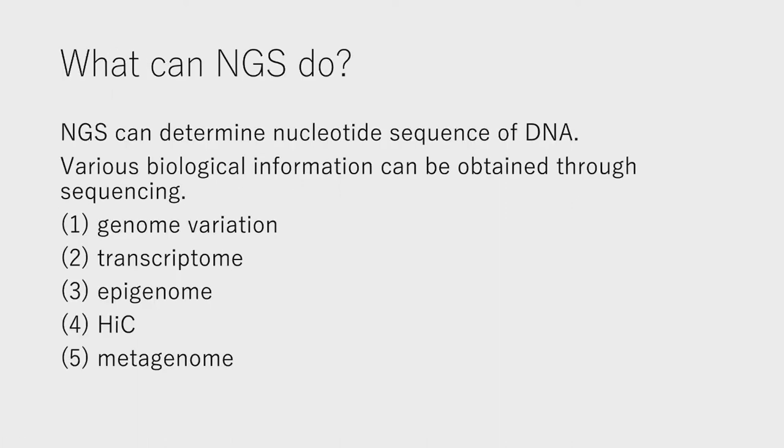Okay, this slide shows a list of the applications of the next generation sequencers. Next generation sequencers can be used for these applications: genome variation, transcriptome analysis, epigenome analysis, Hi-C, and metagenome analysis. Unfortunately, today we don't have enough time to explain all the applications. So today, I'll just explain genome variation, transcriptome, and metagenome analysis.